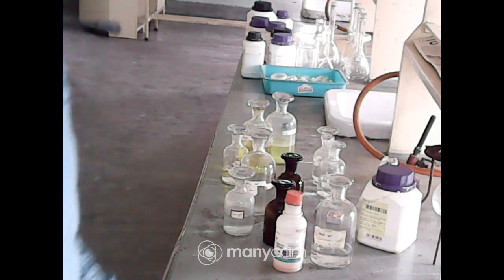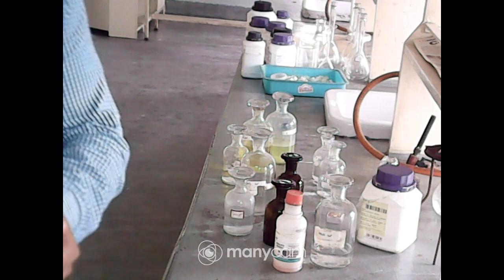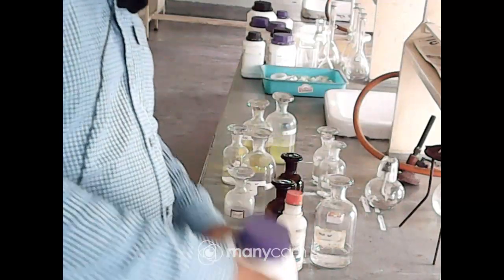Okay, so first I am taking an unknown sample. Suppose this is aluminium sulfate. I am just doing it, taking a known sample. Aluminium sulfate we have taken. So first what I have to do, as I told, this is the solid aluminium sulfate.